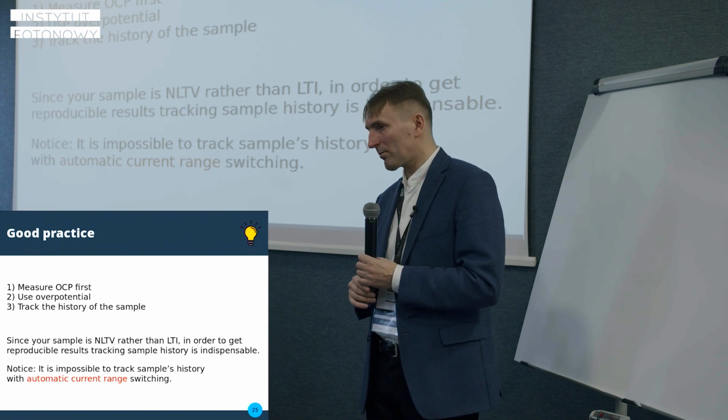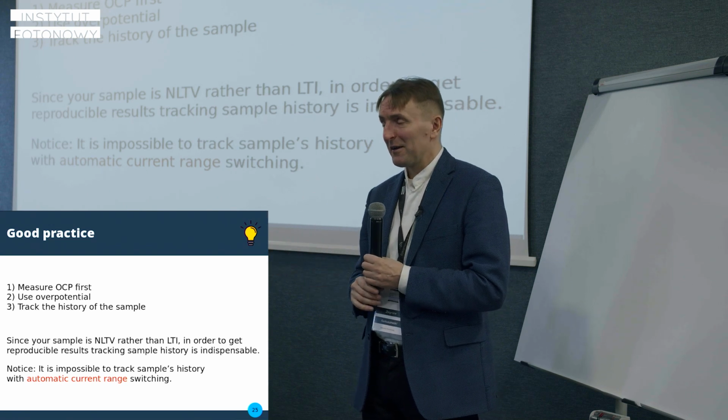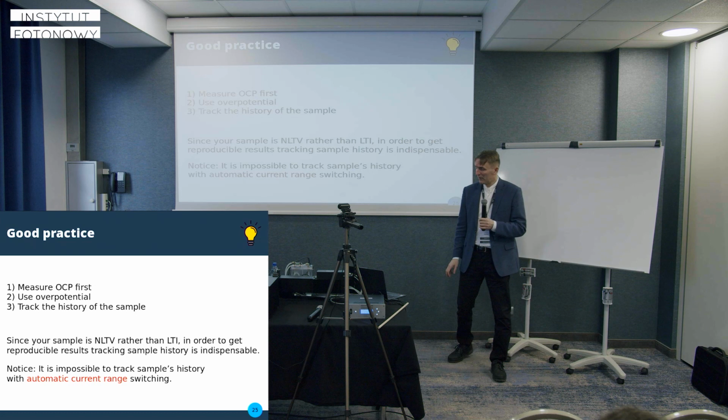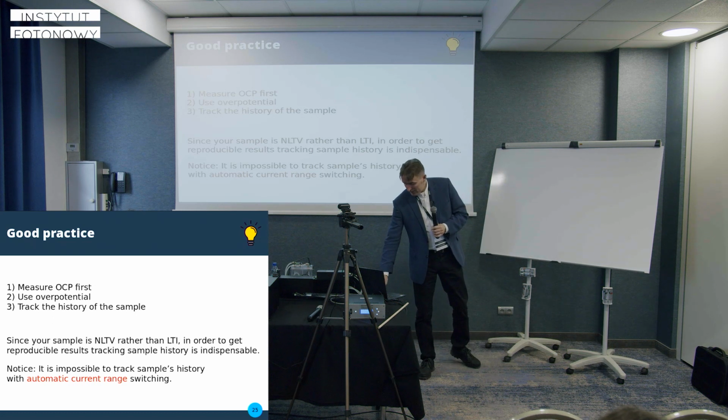So it is to your advantage, not to your trouble. We have those range switching features in other devices, like our light calibrators, because it doesn't matter there. But for samples measured usually in your laboratory, it does. So by default, we don't have this automatic range switching. All right.